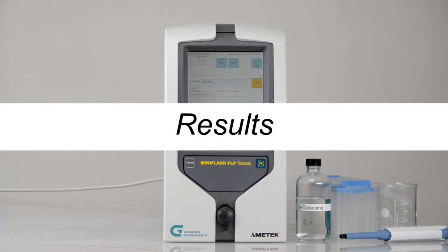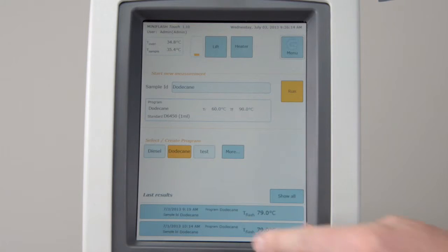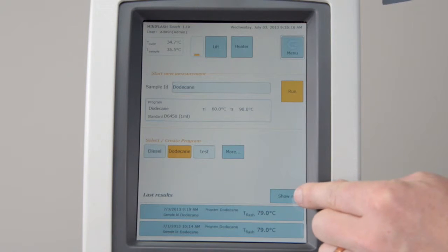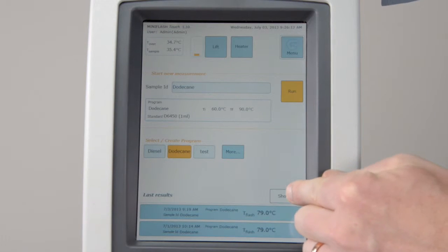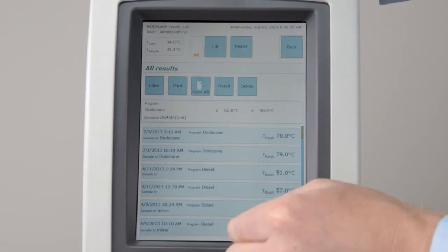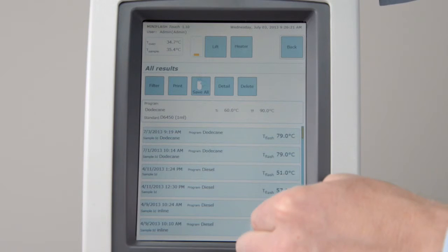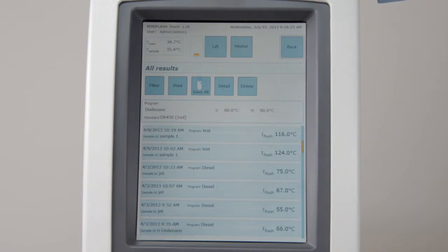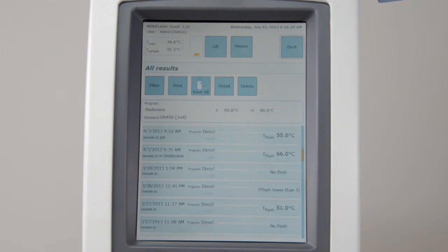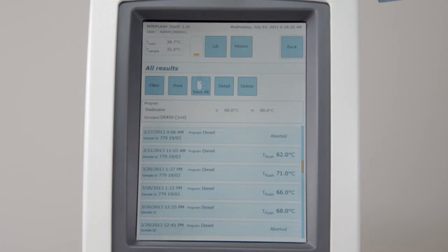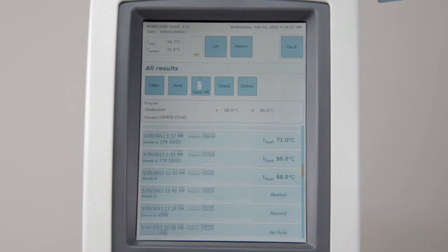Results. The last results are shown at the bottom of the screen. To access the results list, click on Show all results. Scroll up and down through the results list or set a filter to select specific results.